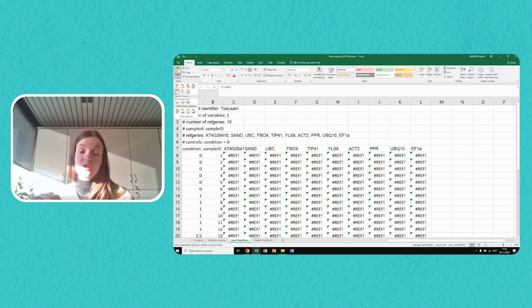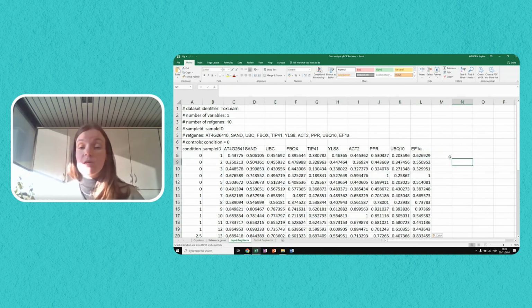Make sure to not just paste them using Ctrl-V, because in that case, Excel will not just copy the numbers, it will copy the formulas. And this is, of course, not correct, because then it will try to apply the same formula to this worksheet, or this tab of the Excel worksheet, and that will obviously not work. So make sure to paste the numbers as numbers.